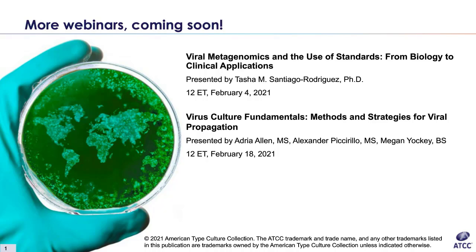I can address it. The one thing about the XTT kit is it is a bit quicker, in that there's a couple of extra steps that the MTT kit has that the XTT doesn't have. Like in the MTT kit, there's a stage where you have to add a detergent to make the cells permeable to the reagent. You don't have to have that with the XTT. And the XTT tends to be a bit more sensitive in the area where you take the absorbance and read it.